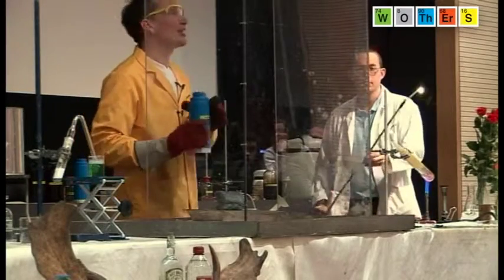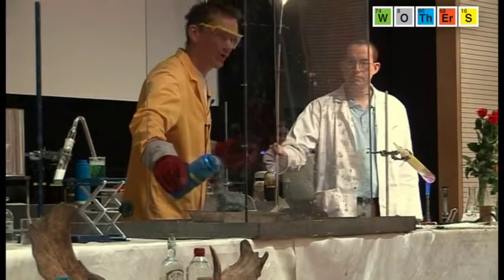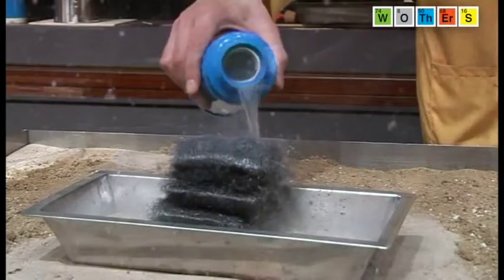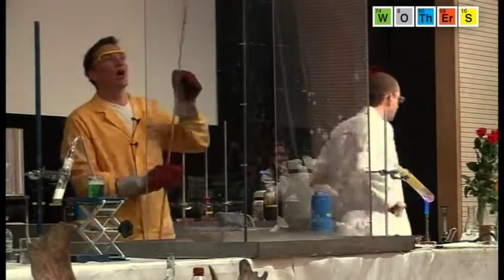By itself, liquid oxygen doesn't burn at all — it doesn't do anything — but it does allow things to react with it and burn in it. Even this iron here can react with the oxygen. So I've added some liquid oxygen.